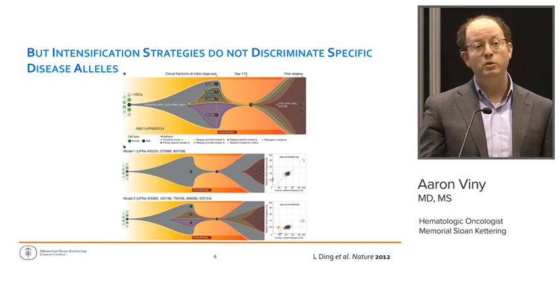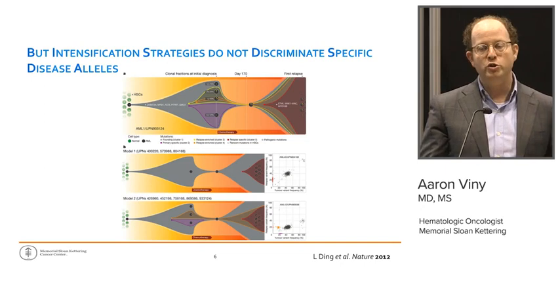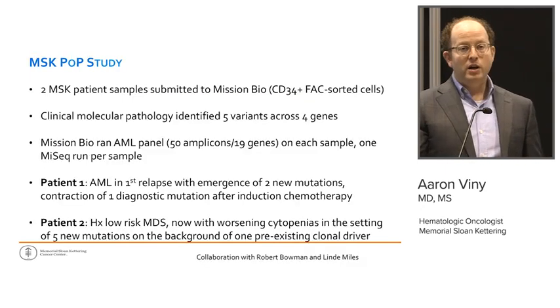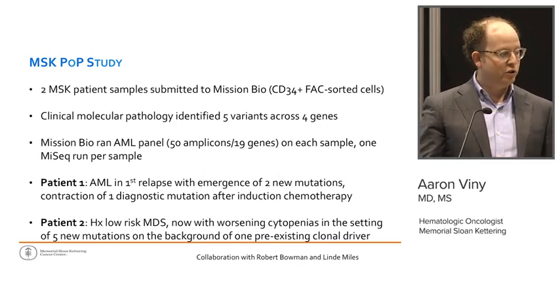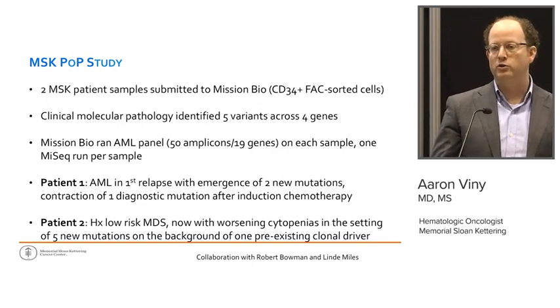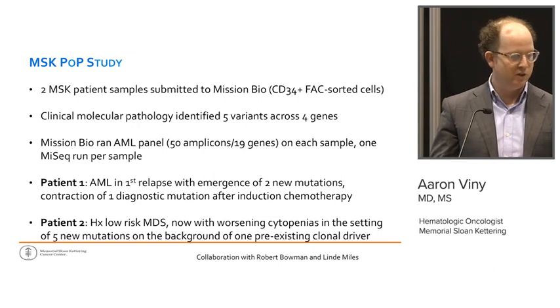And really inform you, especially as new therapeutic tools are coming out, which strategies should be employed. And so we embarked on a proof of principle study with Mission Bio and took 2 samples treated at Memorial Sloan Kettering Cancer Center. We took FACS-sorted CD34 positive cells in CD34 positive leukemias.